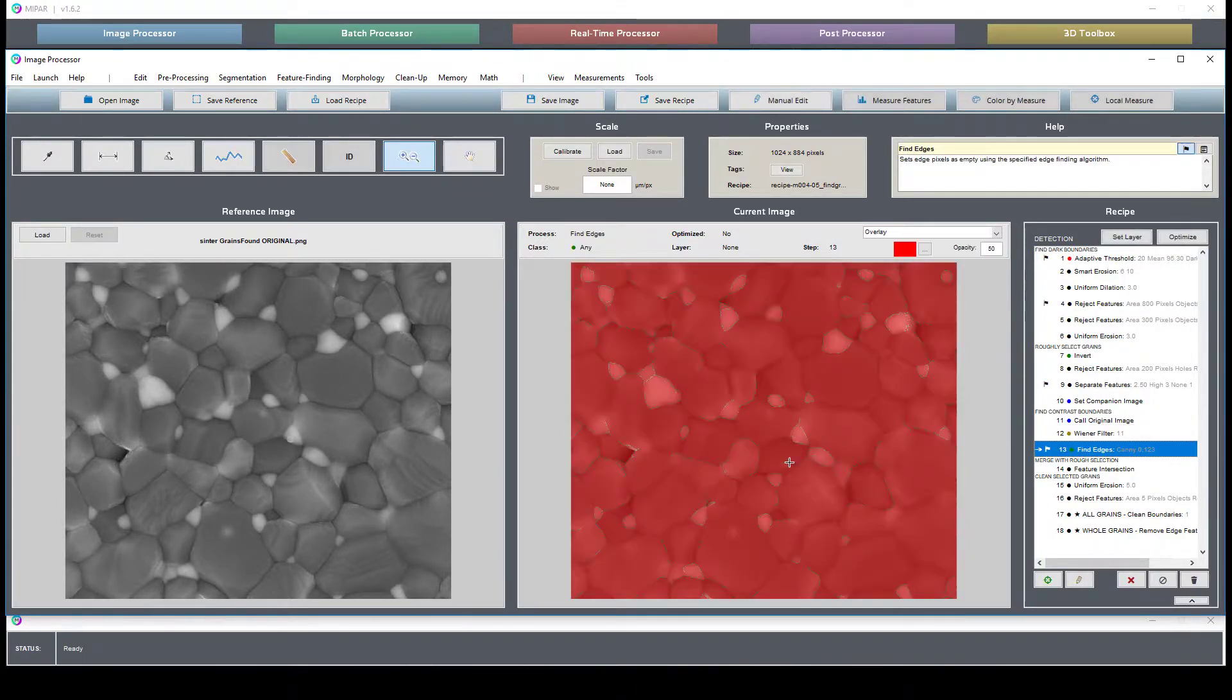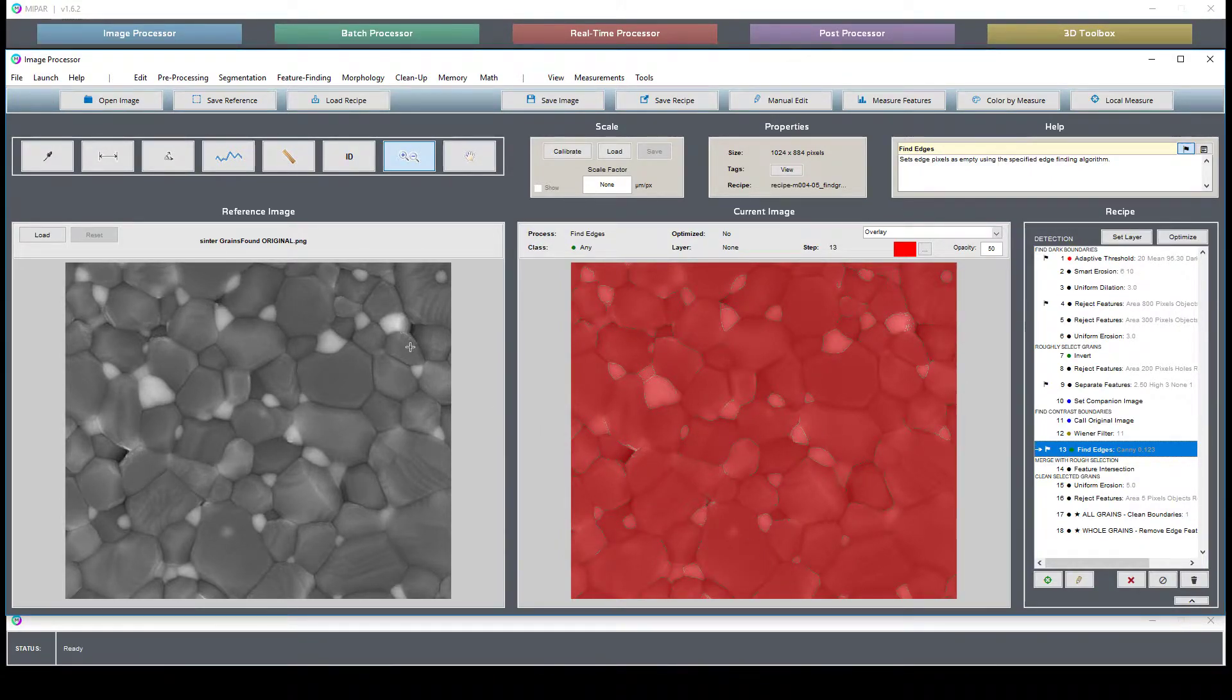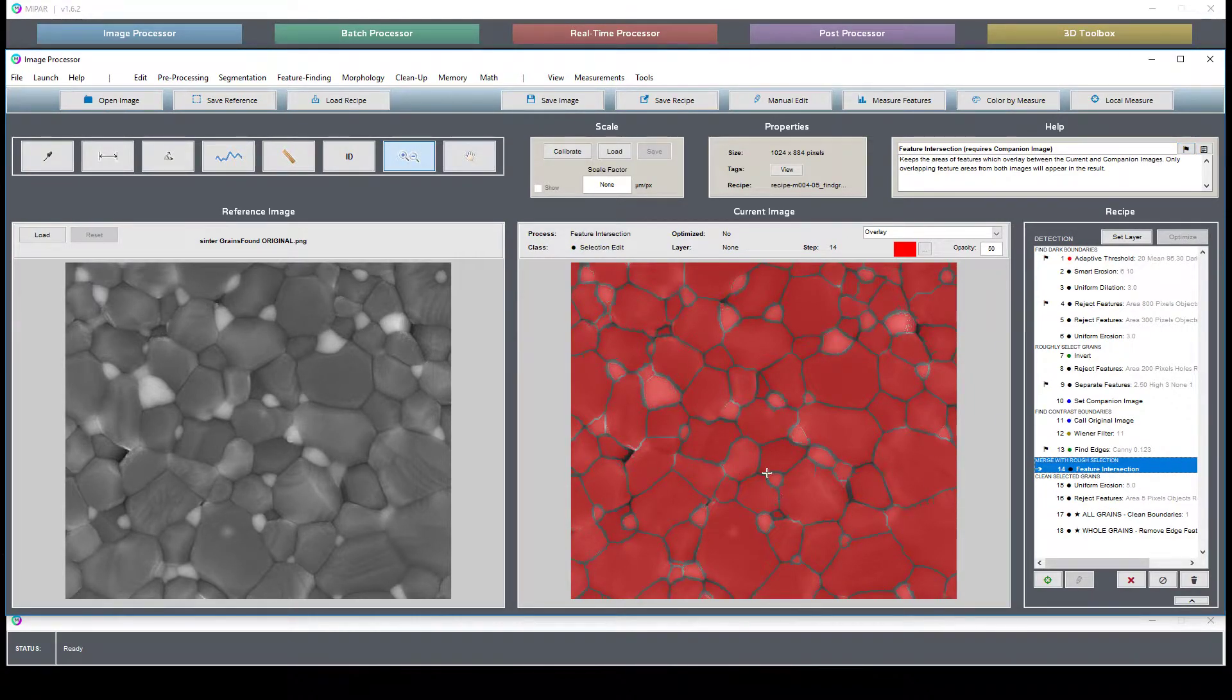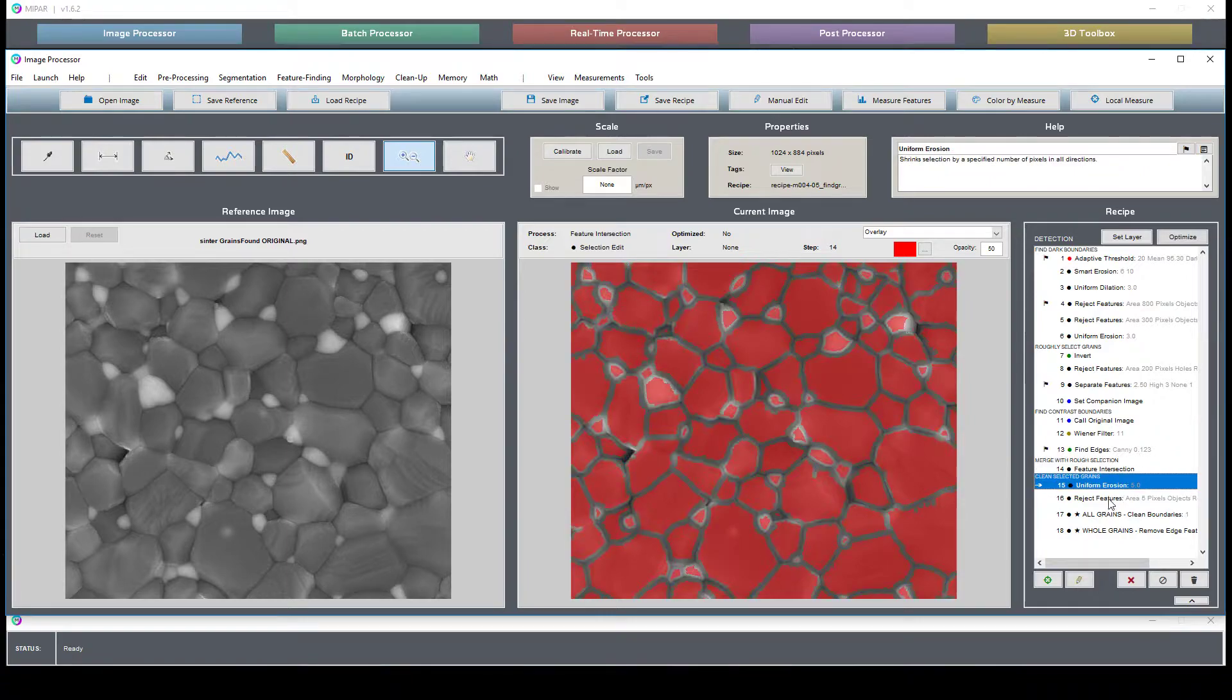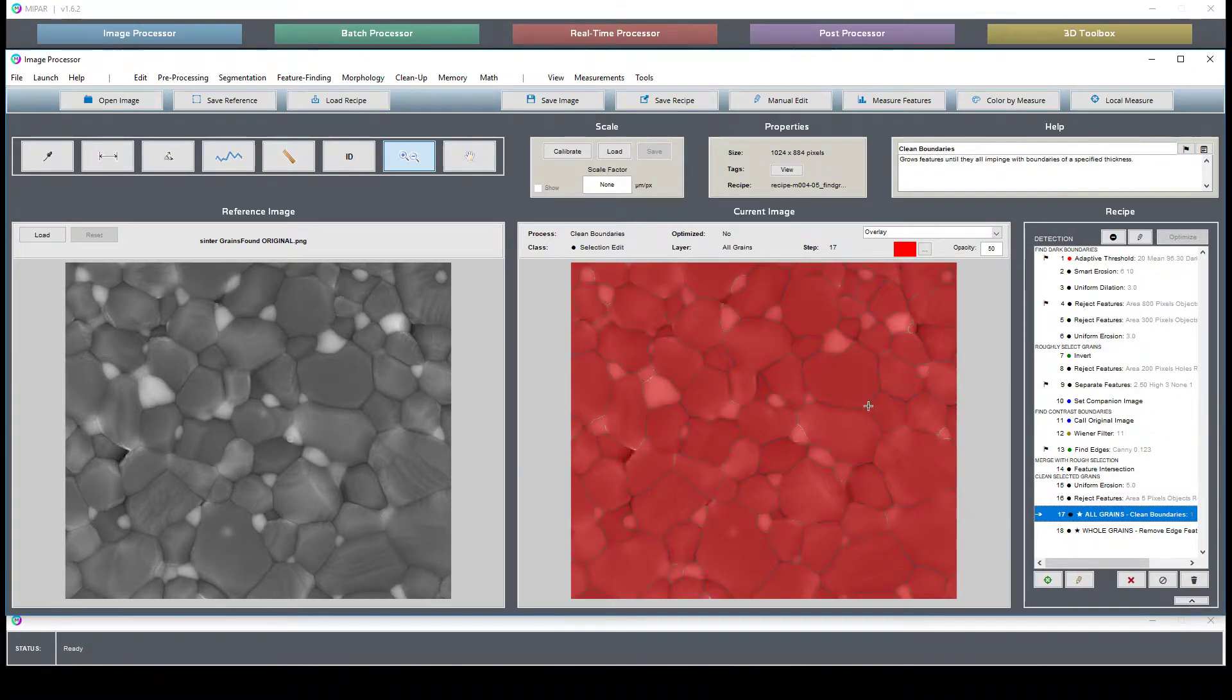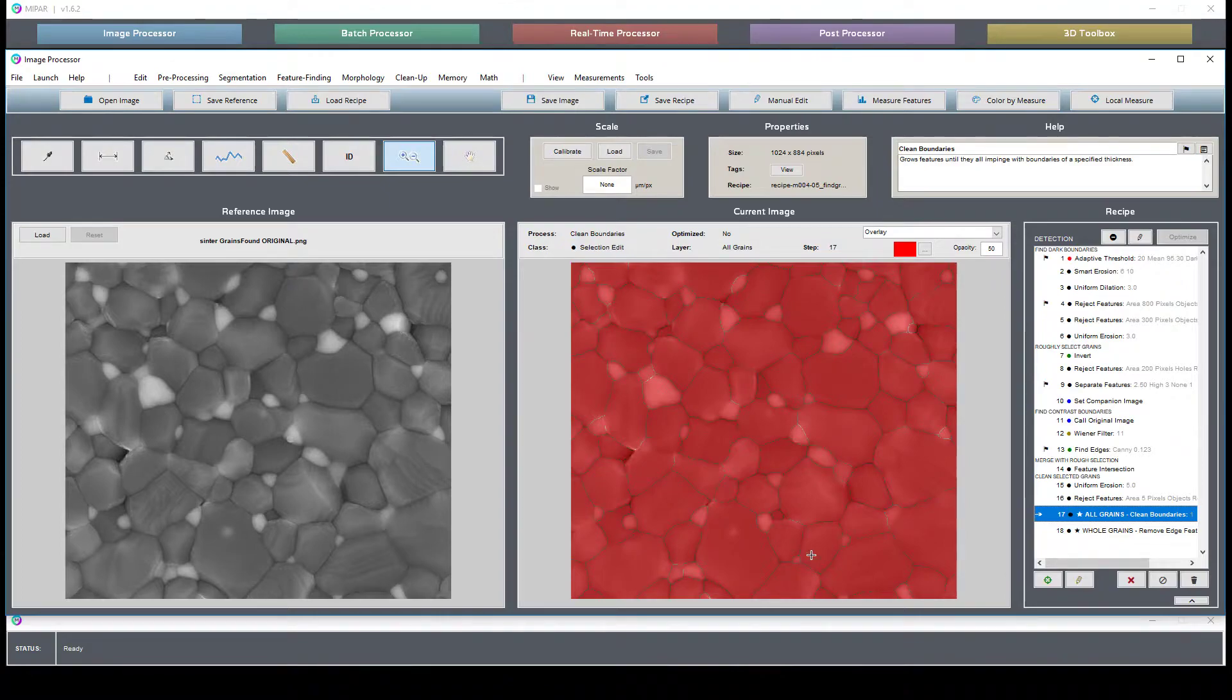One more thing that we do is we run a fine edges detection, which helps us identify these lighter grains where they don't have a very dark boundary around them. So we're able to keep this, do an erosion, and then do a clean boundary step, which really cleans up the segmentation to give us a more accurate grain structure.